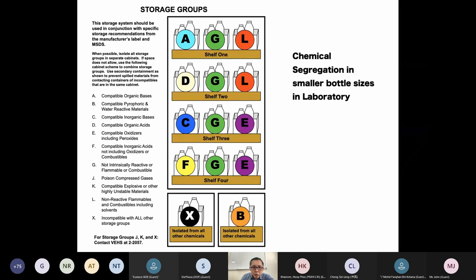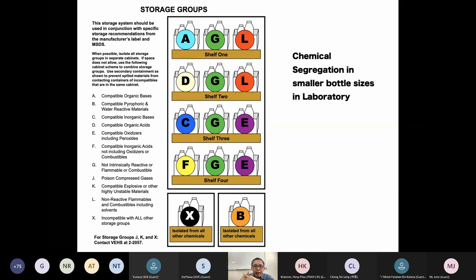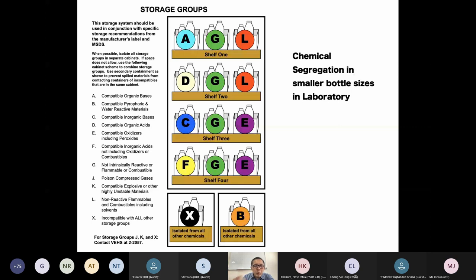I want to highlight a few chemical groups. Look at group X, group B, and group K — these three must be stored in separate, individual cabinets. Group B is water-reactive, group K is explosive, and group X is incompatible with all the rest of the chemicals. These three groups must always be segregated separately.